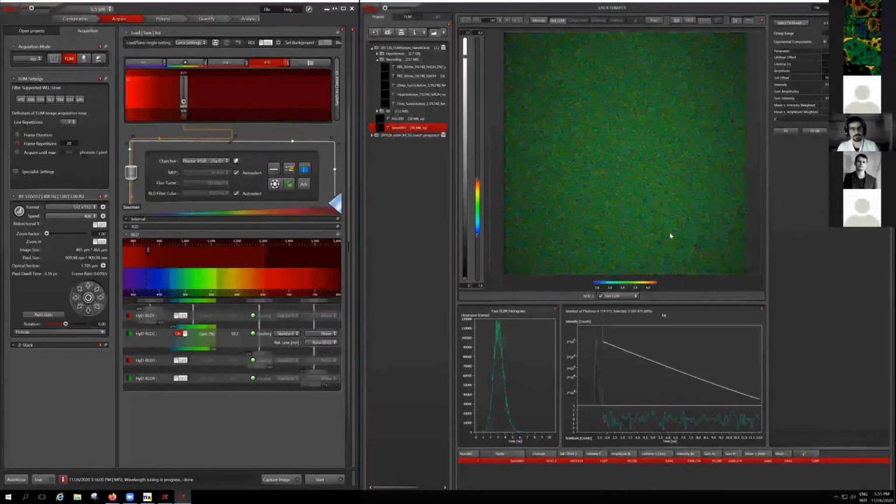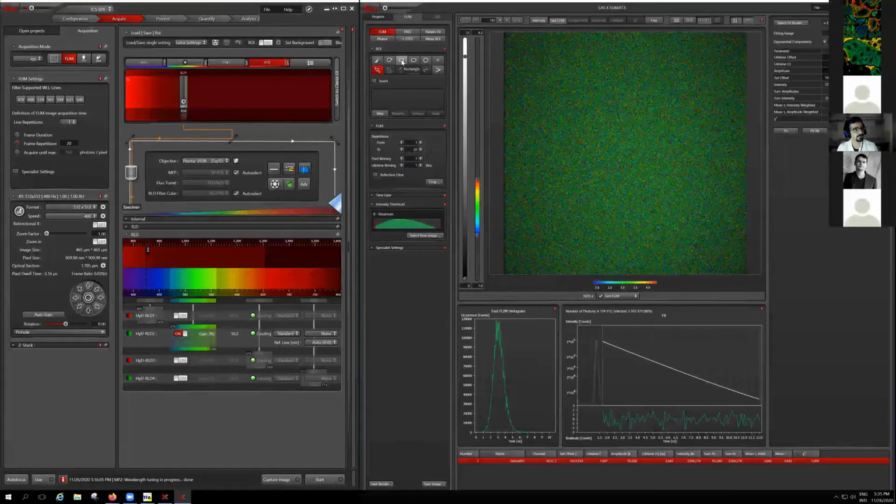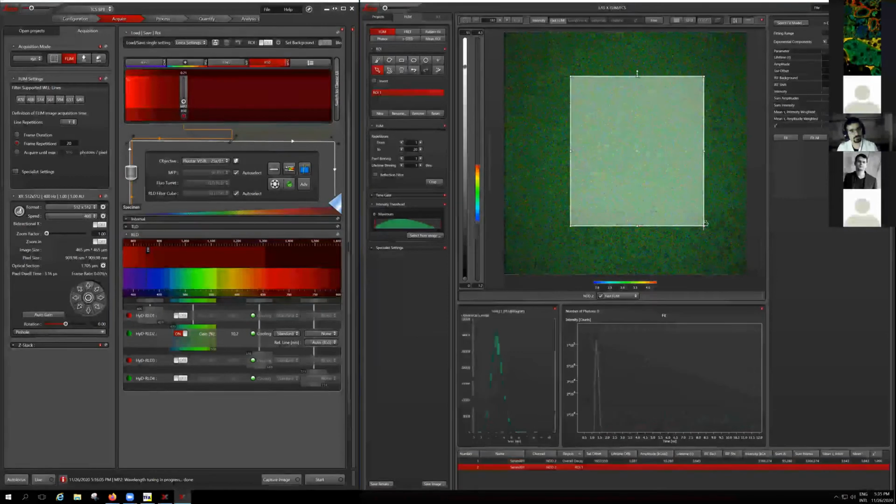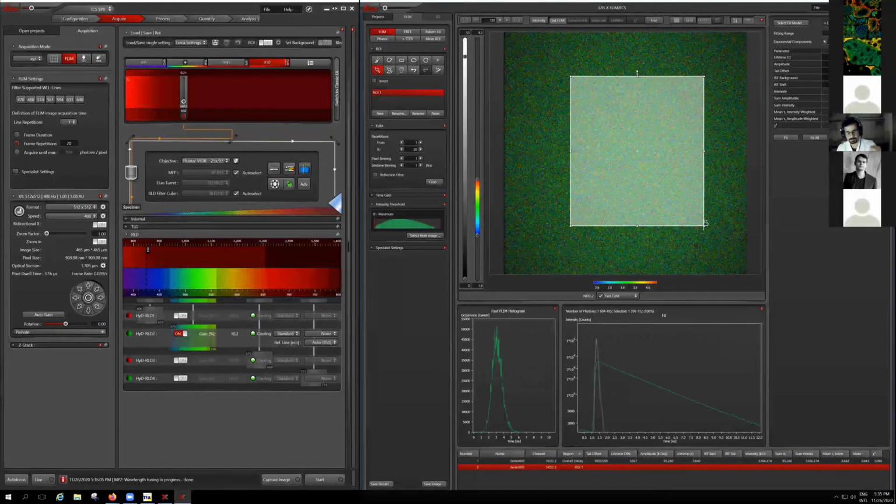I wanted to talk about the analysis and also the difference between the intensity and the amplitude that came off these two. When we do the fitting, it is also possible to use a region of interest, especially when I do it with the solution. I usually like to focus on the middle of the field of view, not acquiring the edges. As you see here, it seems there is some intensity dropping down.